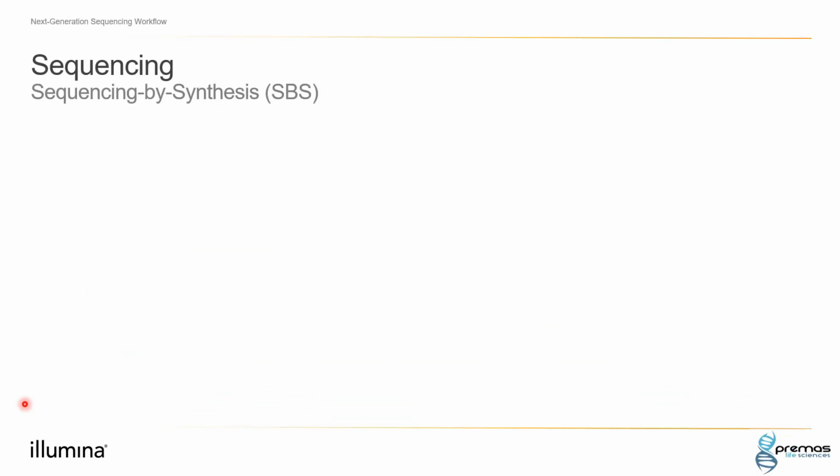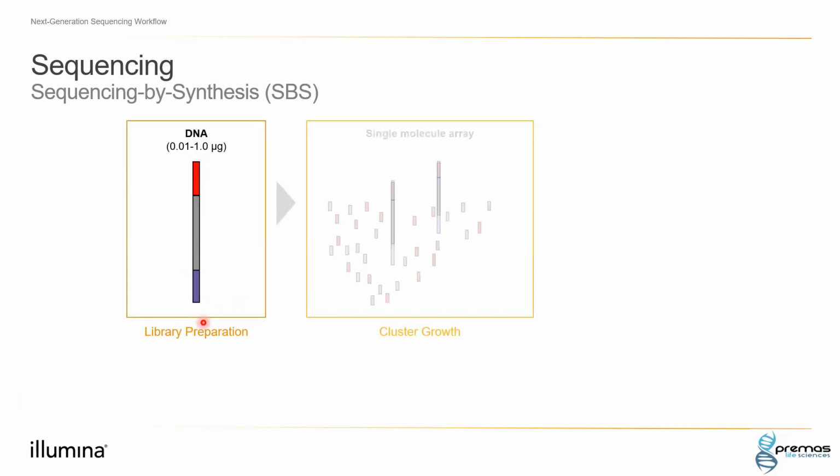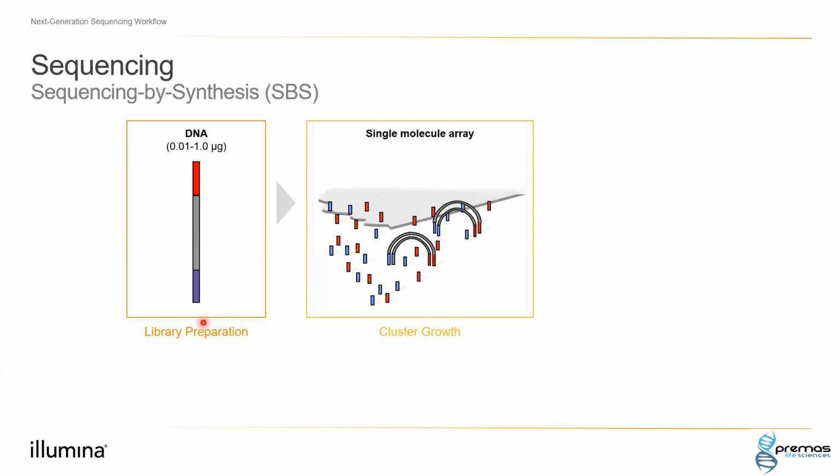Hi. The video might have given you some clarity over the sequencing by synthesis process. So basically, you have your library fragment. It is then clonally amplified. So how is it done? It is done through a bridge amplification process, and it generates clusters. It makes clusters onto the flow cell.